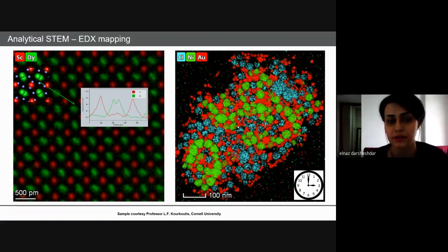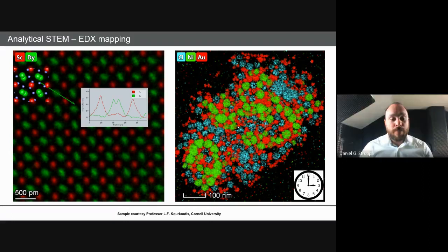So if you want to do chemical analysis, nowadays you want to do this localized, so you want to do a chemical mapping. In the past, the detectors were not so efficient, so typically you would illuminate a large area and count the X-rays from many particles, and you have an average of the sampling. But then the technology evolved, and now it's possible to have this localized information down to the atomic column. It's the same microscope where you can just switch modes to go to the high resolution TEM that I showed, that's the interference image, or to the diffraction mode to get the crystalline structure.